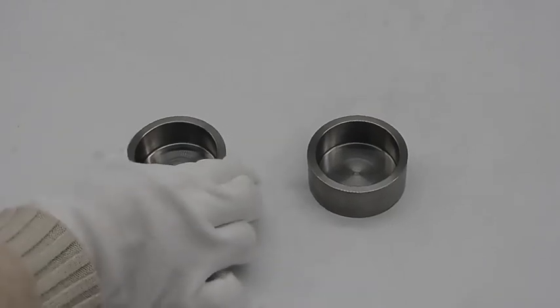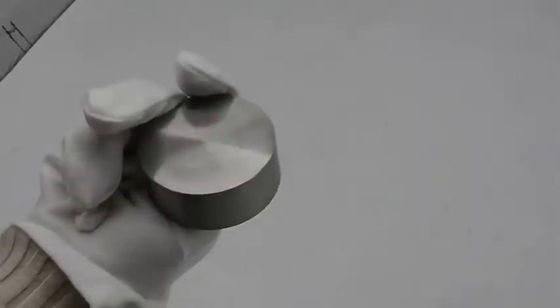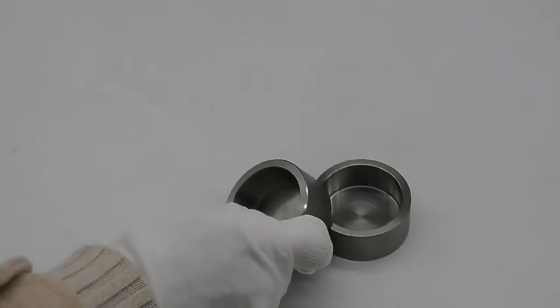This is our tungsten tube. The surface is machine bright with roughness Ra 1.6 to 3.2. You can see there are several radians in the middle, also with threading.